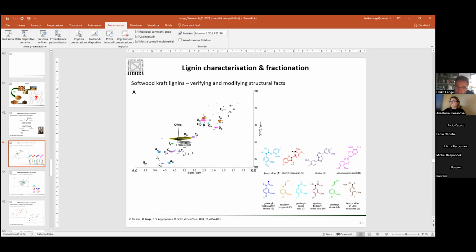If you really have problems on solubility, you might even play with deep eutectic solvents or ionic liquids as a solvent system, with the effect, obviously, that you bring in the peaks from the solvents, right? So then it gets a little bit messy. But if you look specifically for dedicated peaks and you manage to find a solvent system that in the area where your interesting peaks are does not show up, you can do that, right?